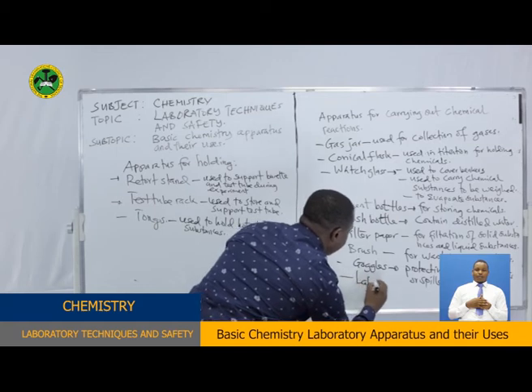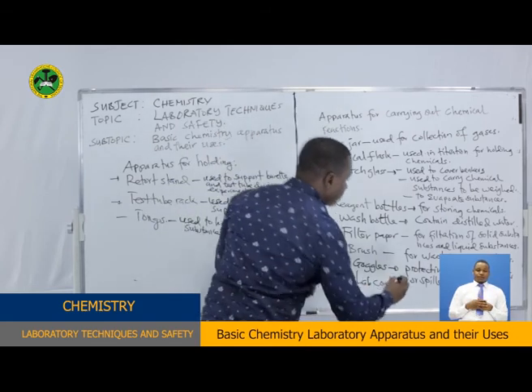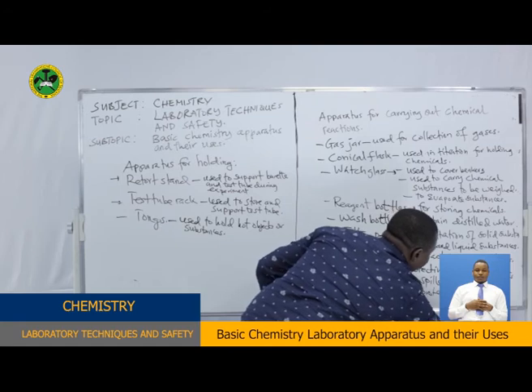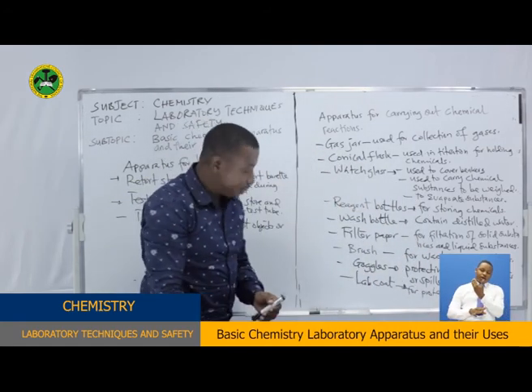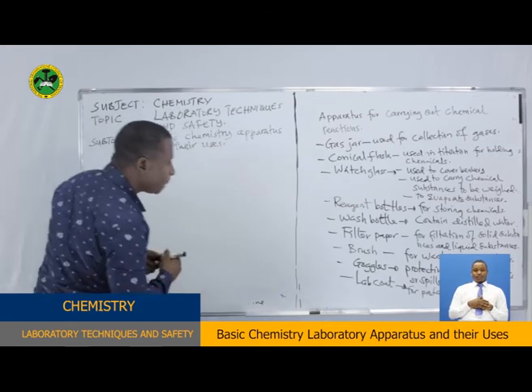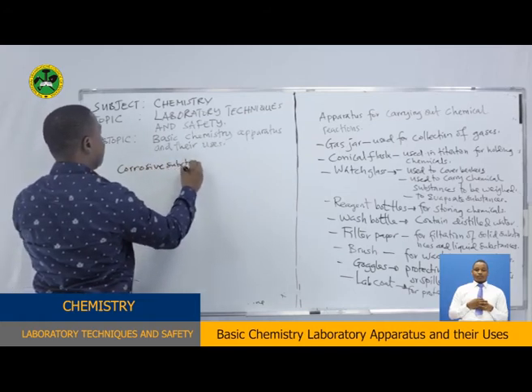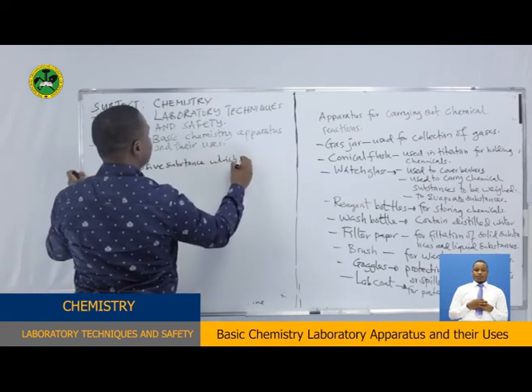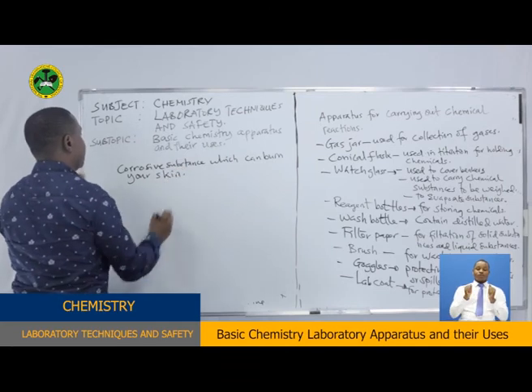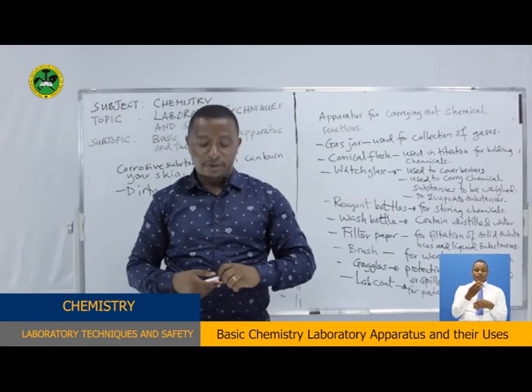So, lab coat for protection against corrosive substances which can burn, or from dyes that can stain your clothes.